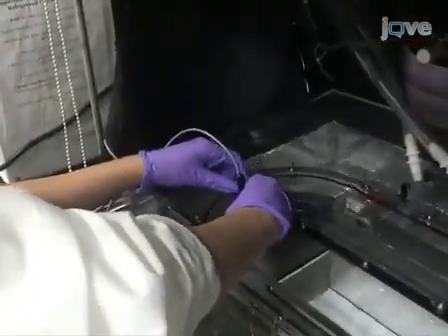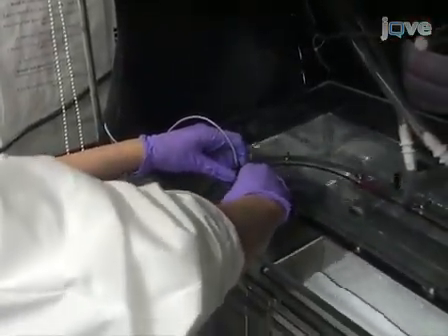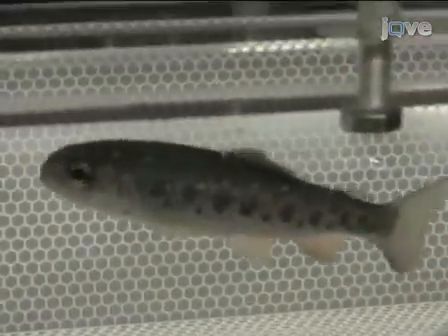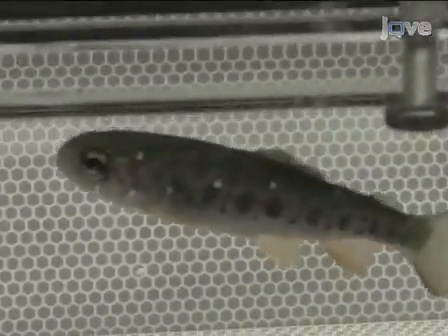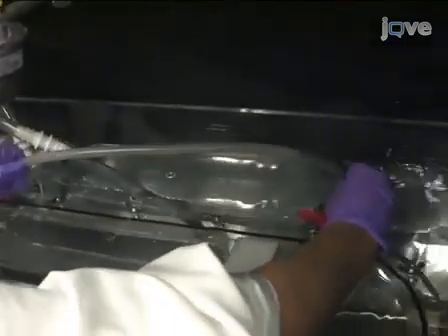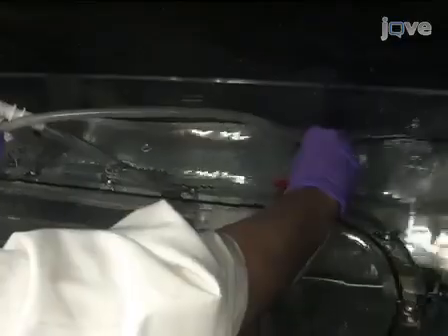Place an oxygen probe into the respirometer. Monitor the oxygen levels in the swim tunnel during testing. Acclimation periods vary between fish. Here, a juvenile rainbow trout is acclimated for 30 minutes. To replenish oxygen, mitigate waste accumulation, and maintain water temperature, flush the tunnel periodically.